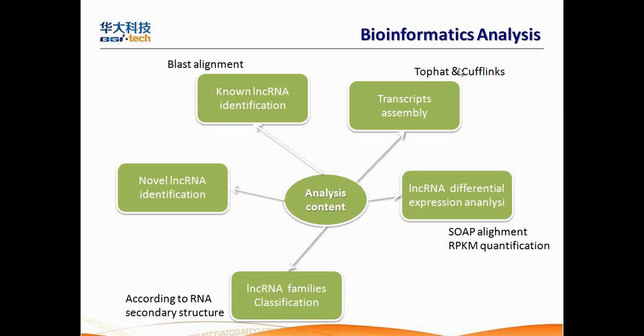And this is a bioinformatics pipeline for the long non-coding RNA sequencing. This kind of analysis includes some BLAST alignment to known databases, and trying to identify some already known long non-coding RNA. And also, since we have the messenger RNA in the sequencing reads, we can use the messenger RNA to do the transcript assembly.